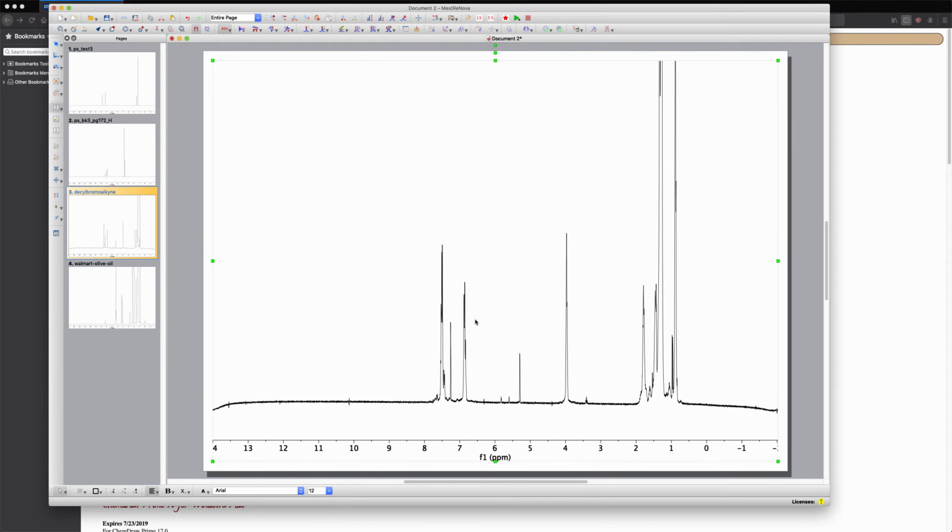And so this regular chloroform in deuterated chloroform is called the residual solvent proton. And every deuterated solvent has that. And there's big tables of it in the NMR room, but the tables are also built into the MestReNova software.